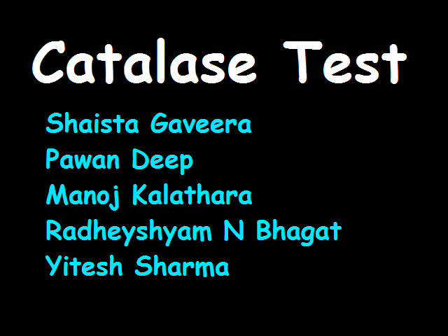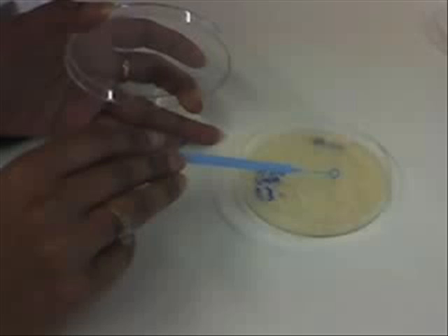Today we are demonstrating the Catalase Test. Firstly, we have taken a glass slide and labeled it 1 and 2 at two different places.